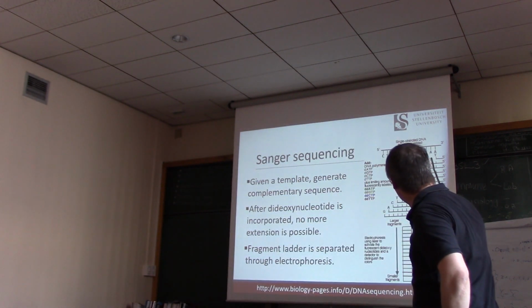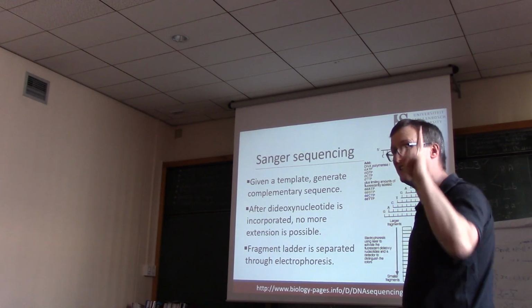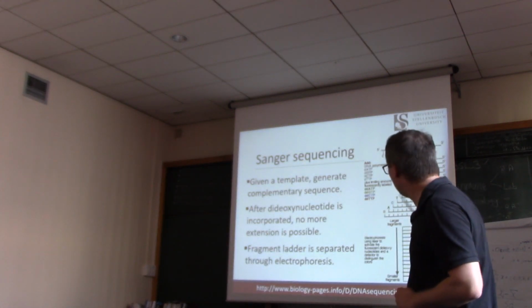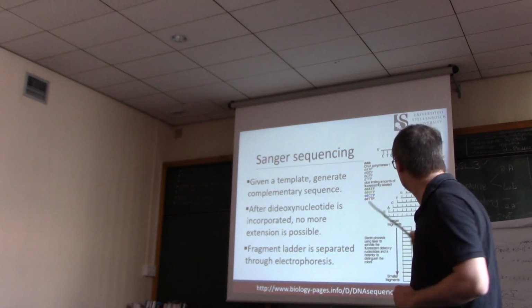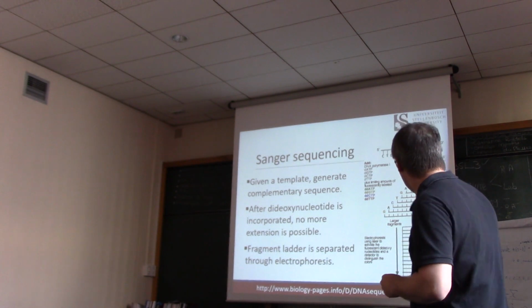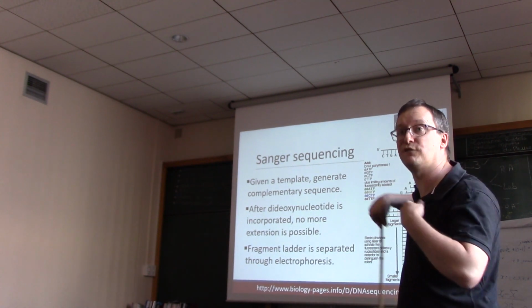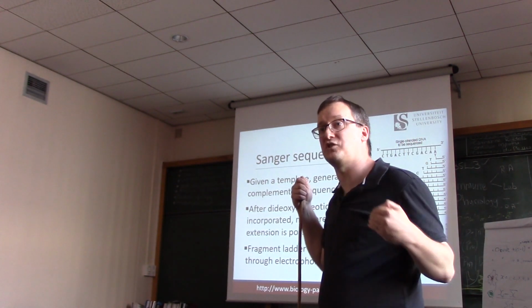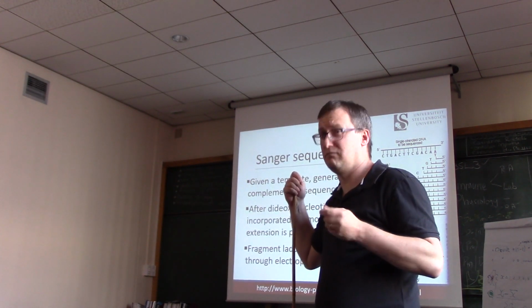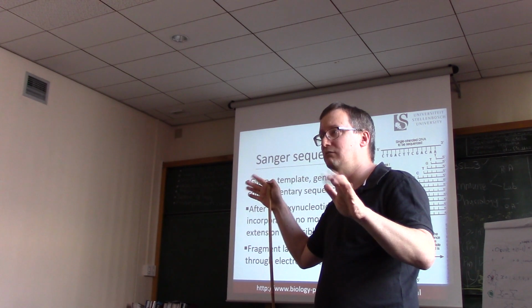Here we see these colored letters represent our dideoxynucleotides. So we see that our complementary strand may range in different lengths. Those can then be separated, often in capillary electrophoresis, and you can simply say which fluorophore appears at each position in this separation, and that tells you what the sequence is. Do people get that from Sanger?